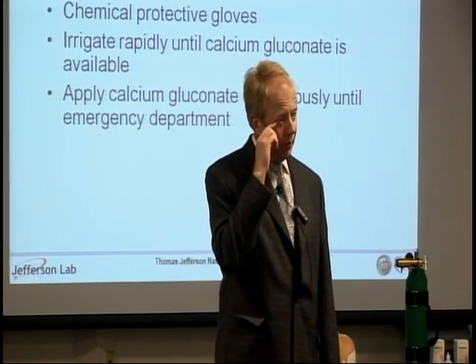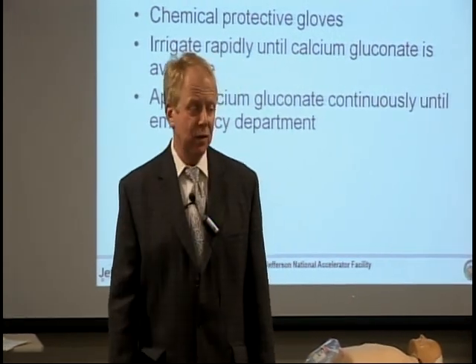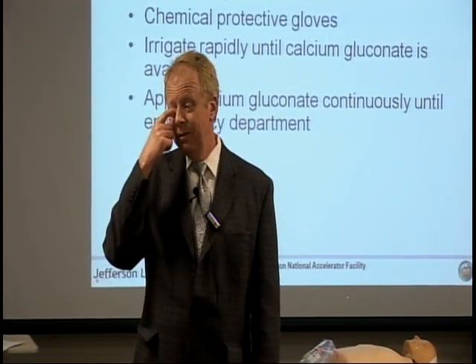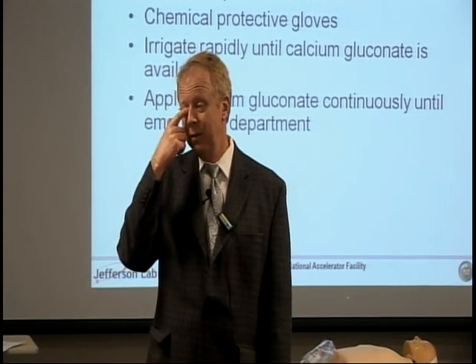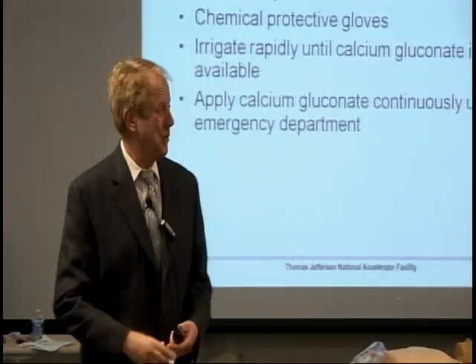You have something like 10 tubes of calcium gluconate in each chem room. Ideally, almost all of those would go to the ER. That would be overkill, but it'd be nice to have. You wouldn't want to take everything because then somebody else might get an exposure.